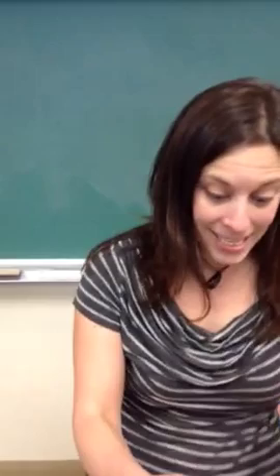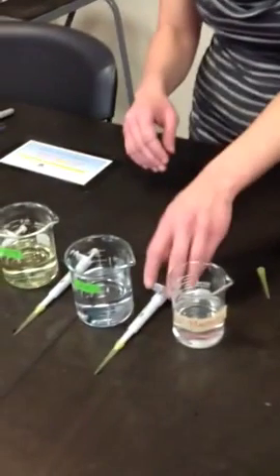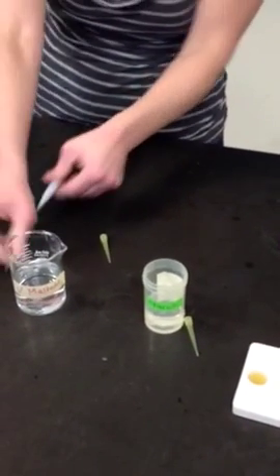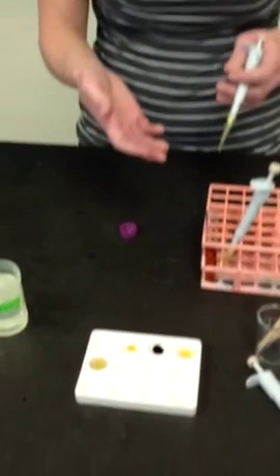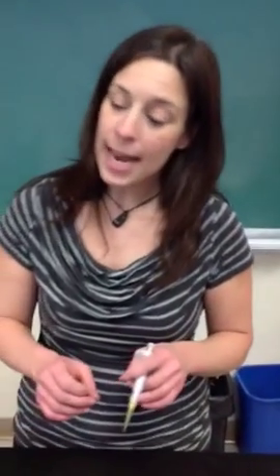Now the last thing we need to test is that our amylase that we're working with, the one from my saliva and the one that I purchased, both break down or digest starch. If the enzyme doesn't work, there's no point running an experiment to see which conditions are best or worst for each amylase. So for that, I will use the same trick I had before for starch, a drop of starch and a drop of amylase in clean wells, and I will let it digest for a few seconds and then add iodine to see if the reaction happened.